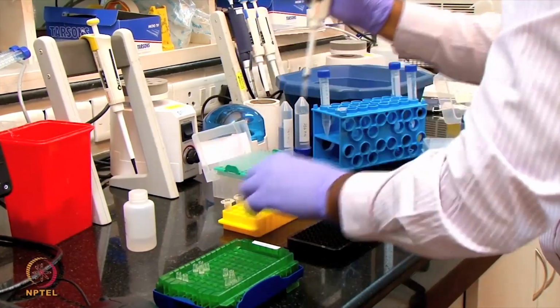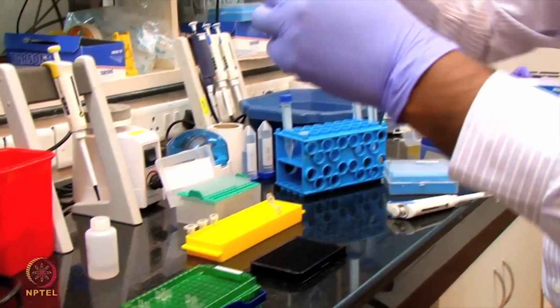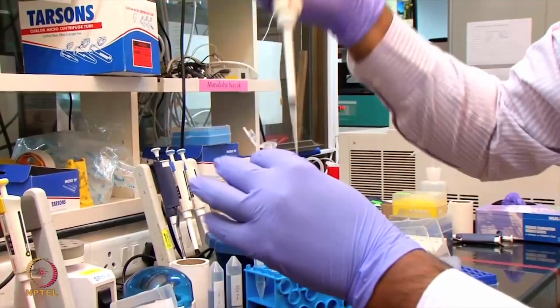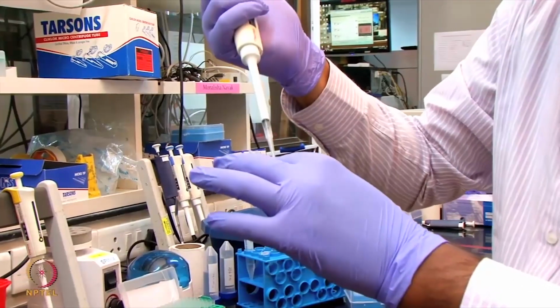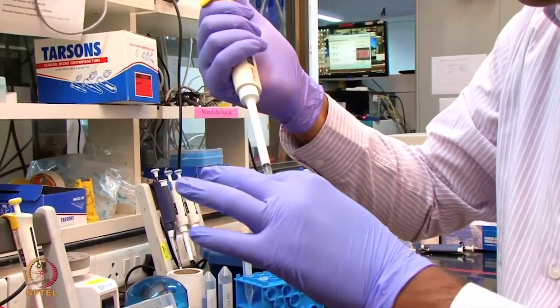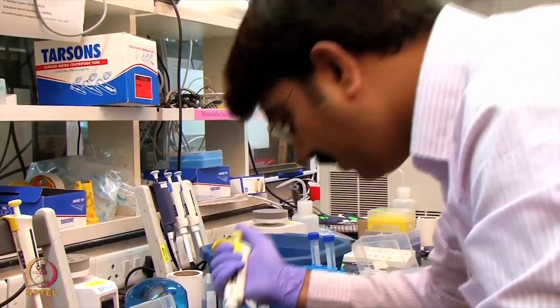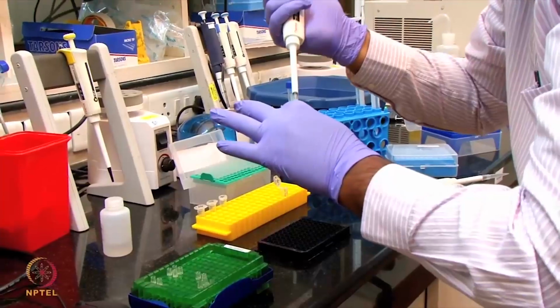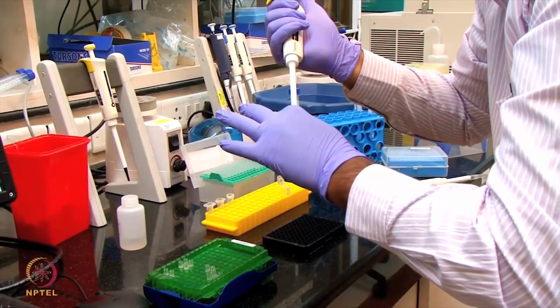Now I am adding 200 microliter of the biotinylated anti-apolipoprotein to the 96 well plate.